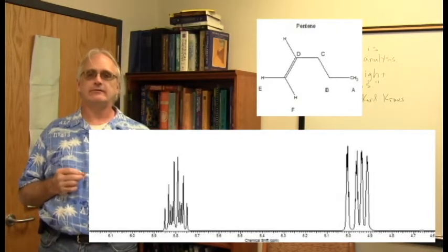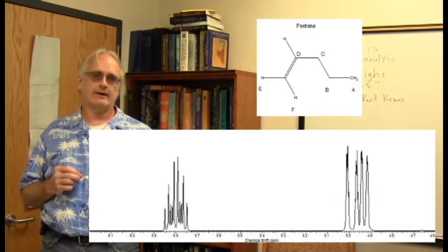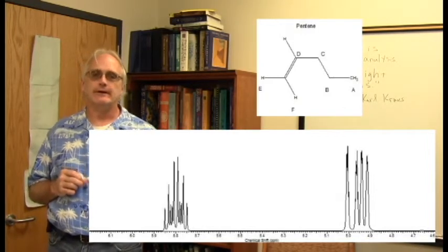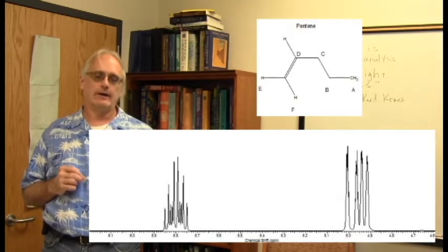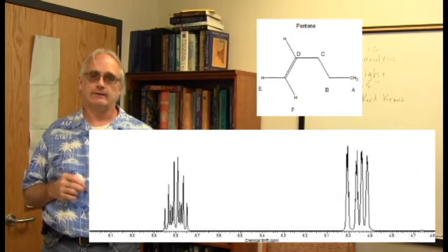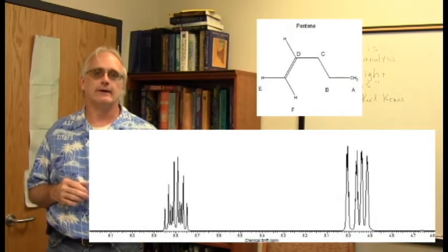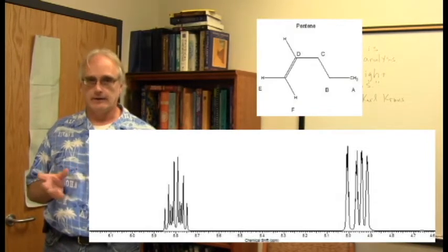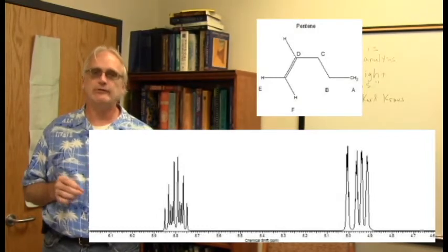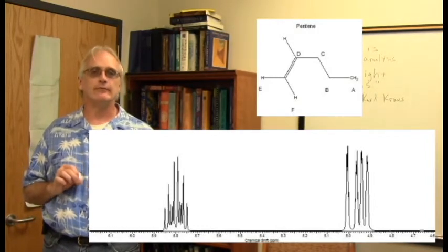Look at the position of proton D for a moment. This proton is trans to another alkene proton, expected to have a large coupling constant, cis to another alkene proton. They're not going to be equivalent to each other, so there's 2 separate doublet influences.